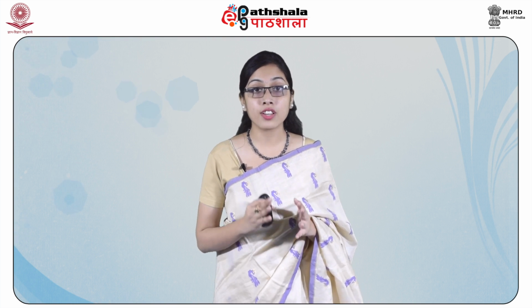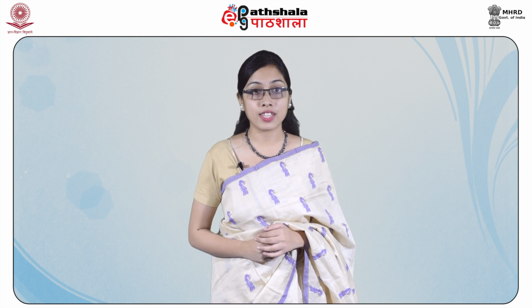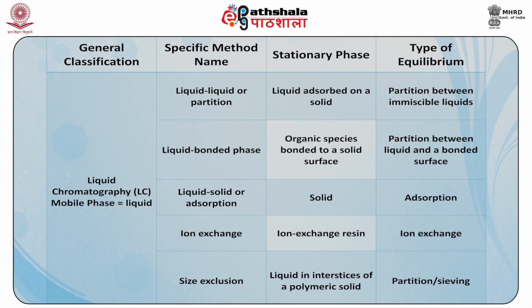The column chromatography types can be further classified, and this classification has been explained in this table, wherein one column gives the general classification, the other column shows the specific method name, the third column shows the stationary phase, and the fourth column shows the type of equilibrium. Let us first start with liquid chromatography, where the mobile phase is liquid. There are specific methods under this type.